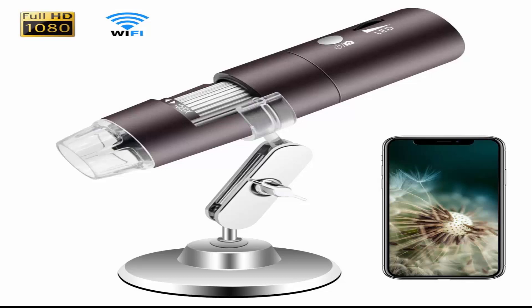Easy to use — simply download the app and connect it to Wi-Fi following the instructions, then start to view a microscopic world right on your phone, tablet or laptop. Compatible with Android 4.3, iOS 8.0, Windows Vista, 7, 8, 10, and Mac OS X 10.8 or later.